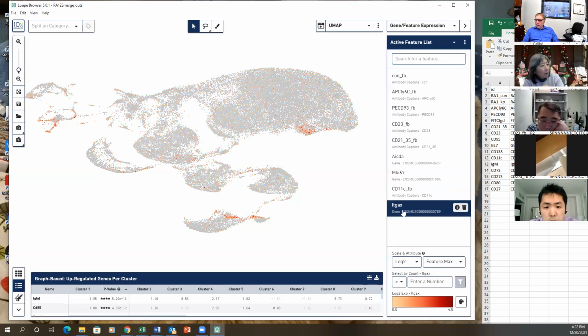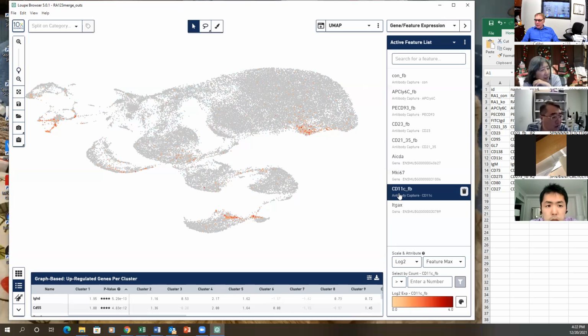Oh, that's interesting, isn't it? It worked. Yeah, I see, so it works, but not too many positive cells. That's the issue. But I think amazingly, it does work better. Right, that's amazing.